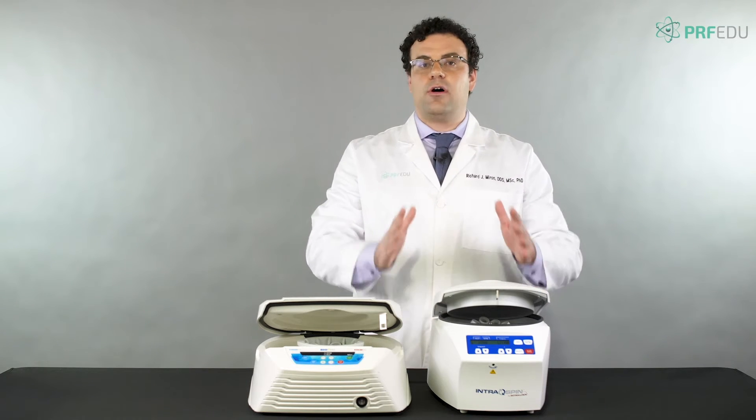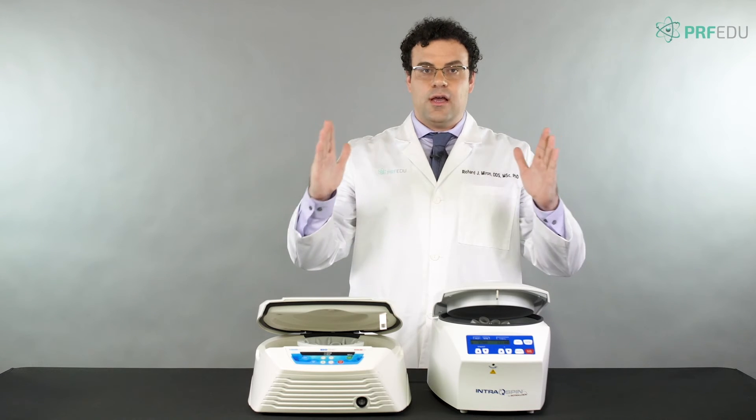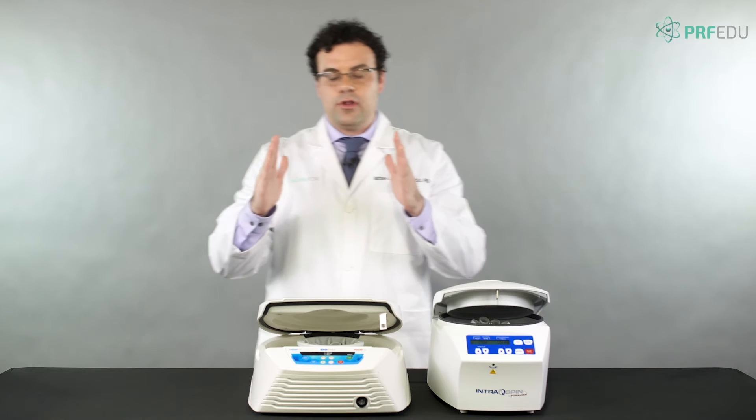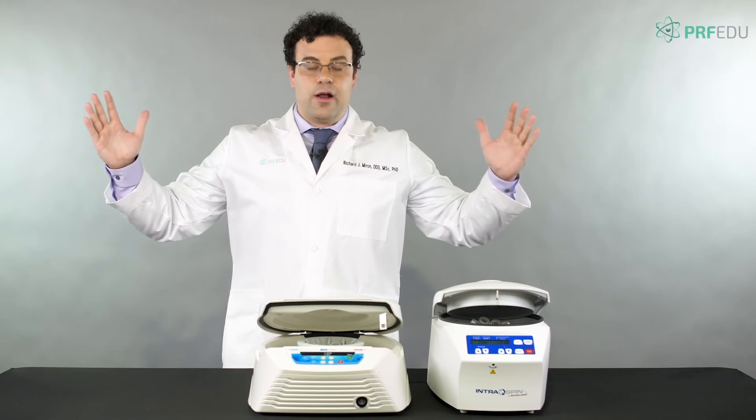The reason they're always smaller is because when the tubes go in at a fixed angle — say 45 degrees — the footprint is narrower. With the horizontal centrifuge, the tubes go completely out, so it requires a bigger space.